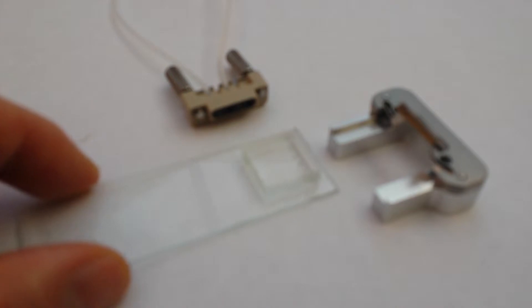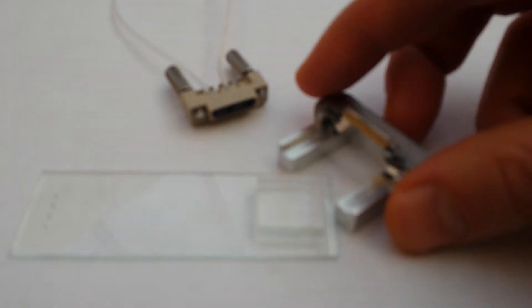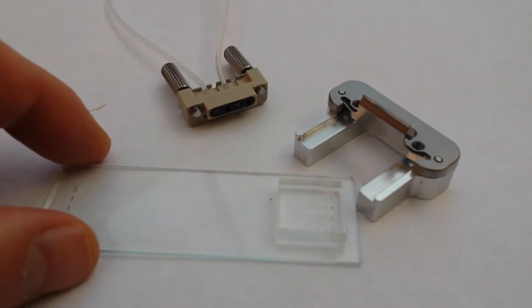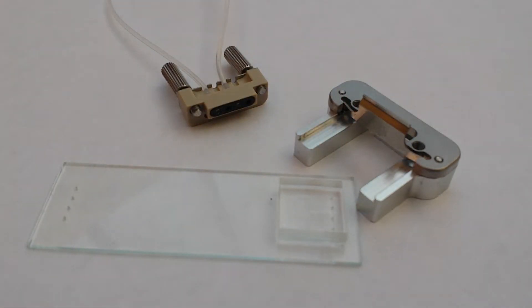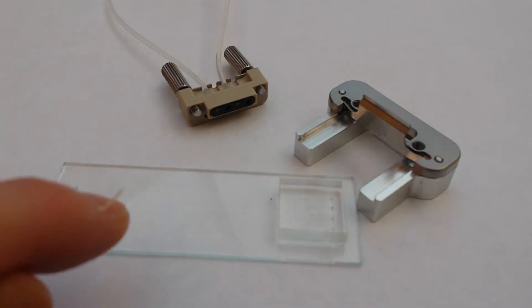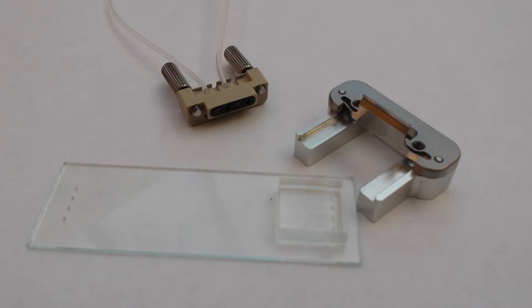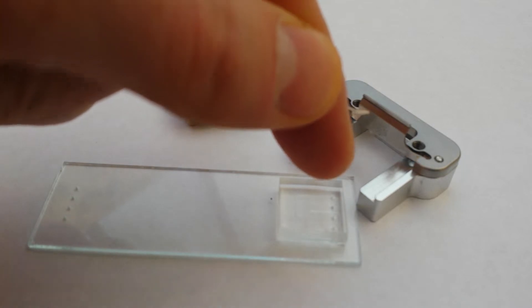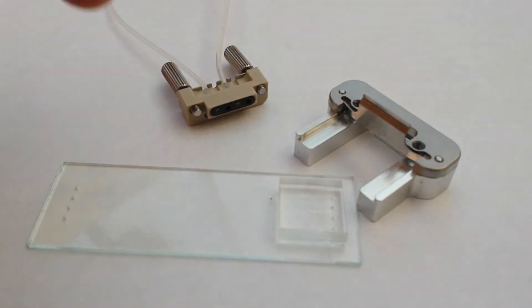So let me talk you through this system a little bit. We have four holes on this side and four holes on this side. You can design your PDMS chip to be quite large — this slide is 75 millimeters by 25 millimeters — so you could span a device from one end to the other with inputs on one side and outputs on the other. With this particular device, they've designed the inlet to twist around and come out on the same side, which means you only have to make connections on one side — a much more intelligent design.